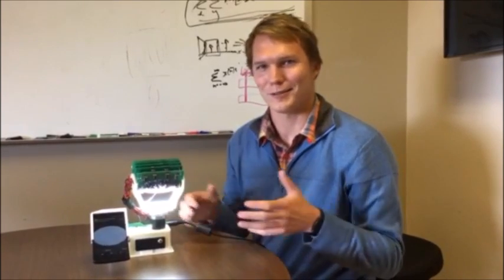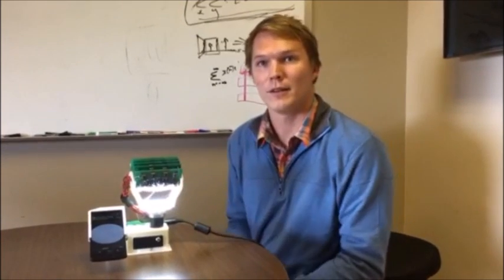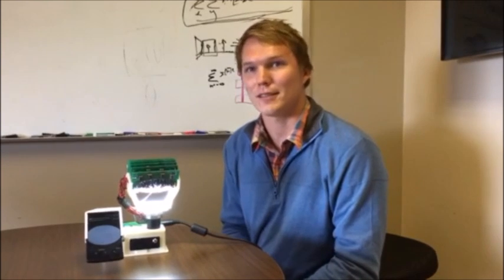And microscopes are like $10,000 or so. So this whole device here, minus the cost of the smartphone, is about $1,000. And that's our first iteration, so we think we can get it to at least half that cost eventually.